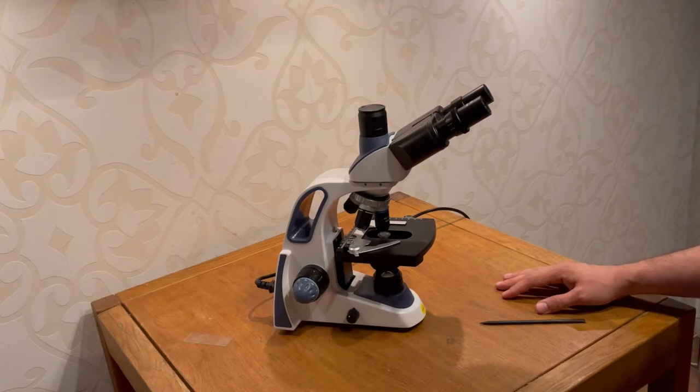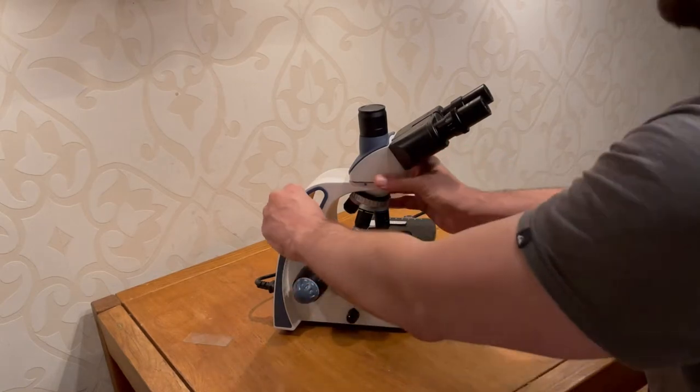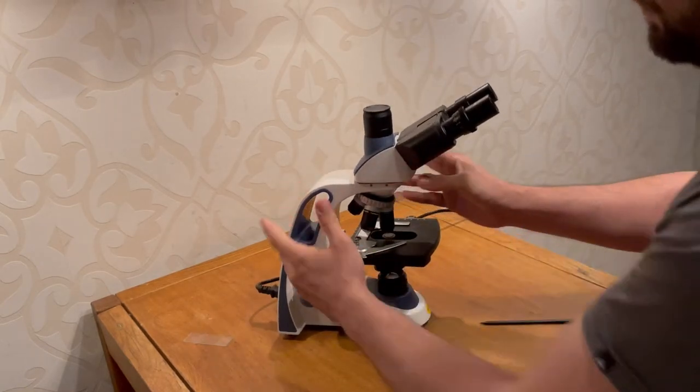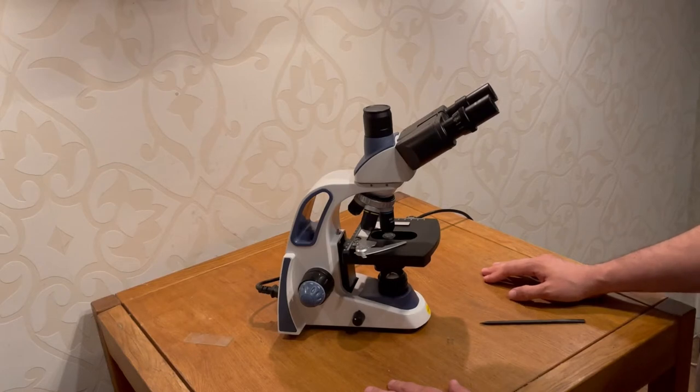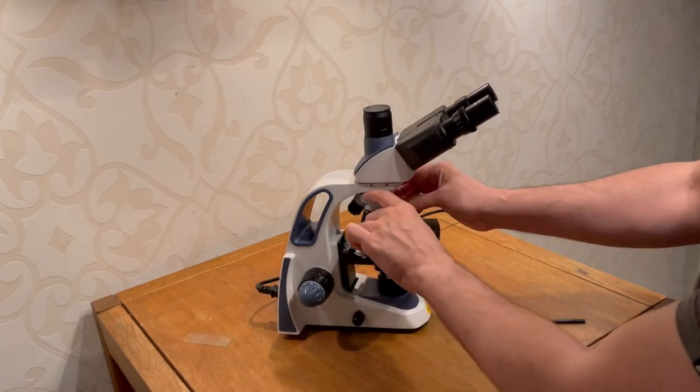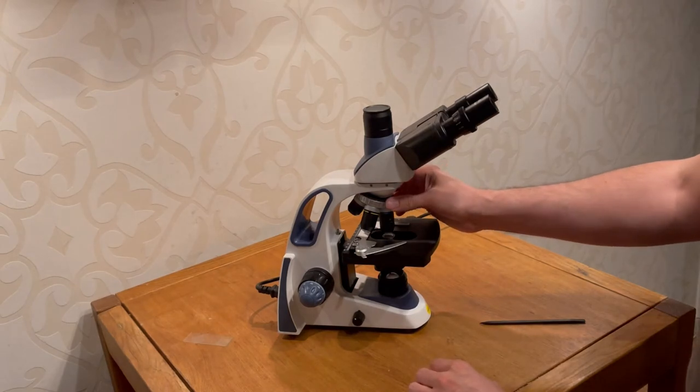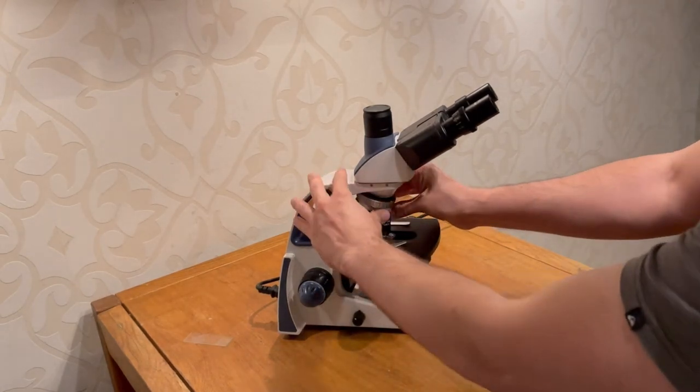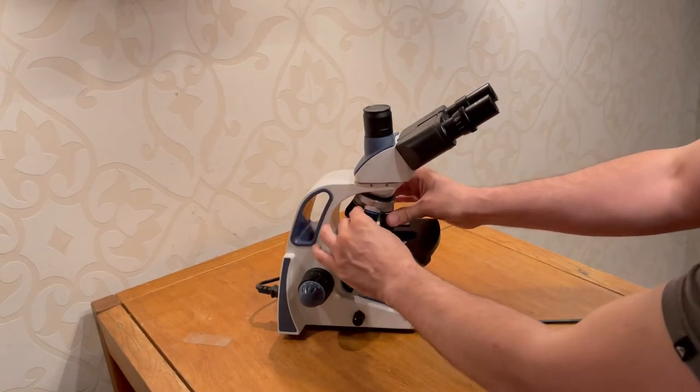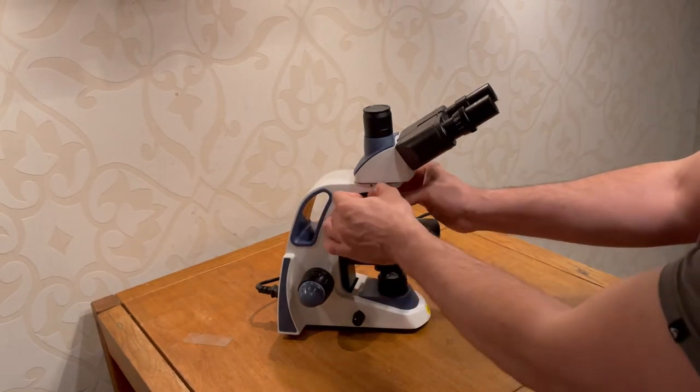The first thing you're going to notice is that it's a very nicely built microscope. It looks like good quality stuff. One of the things that I've noticed is that this thing, the objective holder, is actually, was actually spinning. So you could change the objectives, but also the whole holder would rotate.